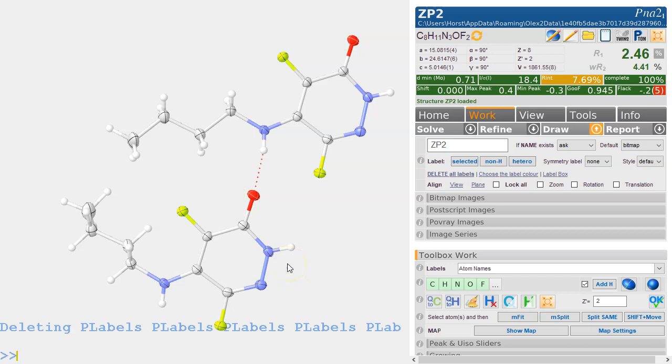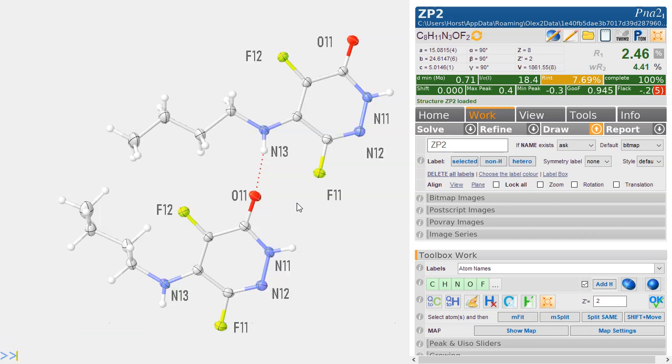You can double click on that. Control A will now select all the labels. Delete deletes all the labels. If you go SEL $N $F $O, so these are all the hetero atoms we've got in here, and type label without any extensions, then you just get the normal labels without the residue number, which of course is a bit confusing.